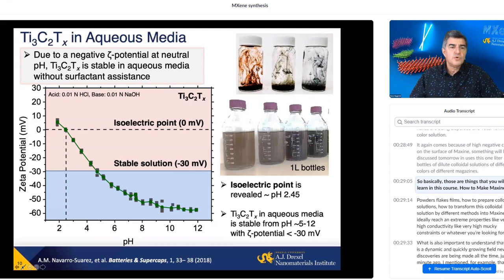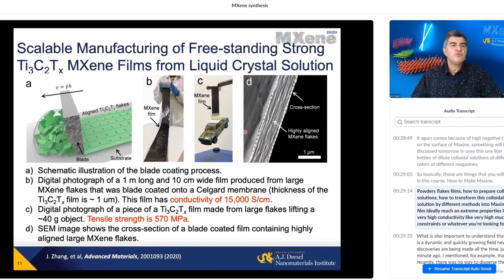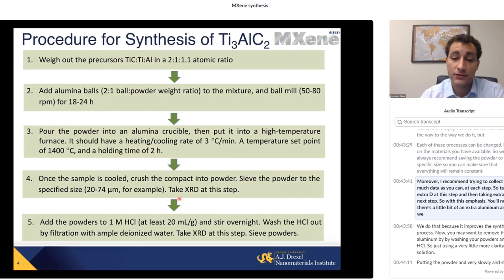So basically, those are things that you will learn in this course: how to make MXene powders, flakes, films, how to prepare colloidal solutions, how to transform this colloidal solution by different methods into MXene film, ideally reaching extreme properties like very high conductivity, very high mechanical strength, or whatever you're looking for. And sieving the powder to a specific size so you can make sure that everything will remain constant. Moreover, I recommend trying to collect as much data as you can at each step. So taking XRD at this step and then taking XRD at the next step.